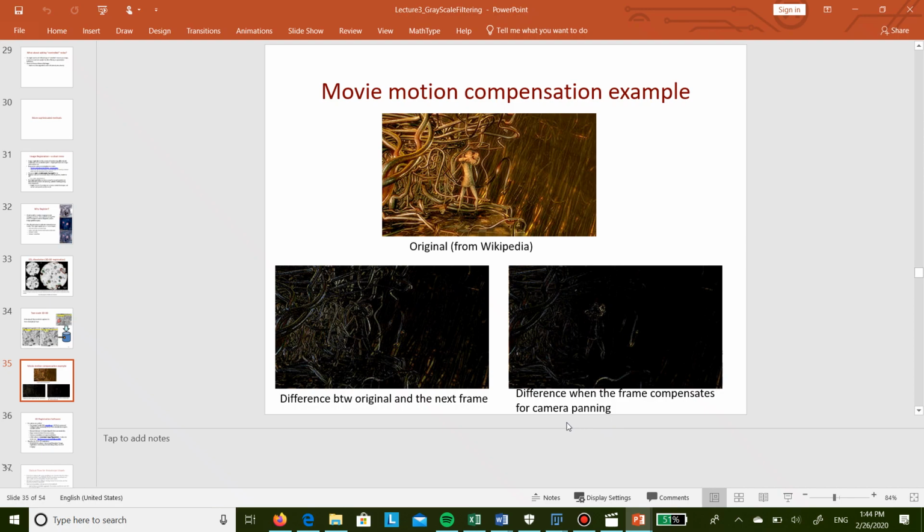So you often have to compensate for that movement. What they have there is that they can take a lot of images, more frames per second, and because of those correlations they can compensate and sharpen the images as a result.